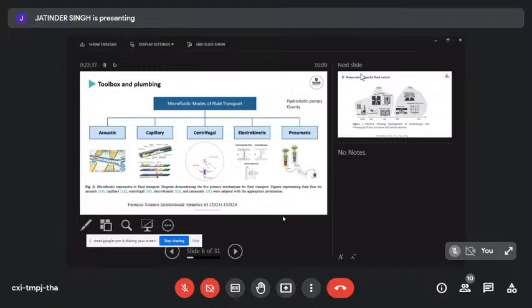If you just want, for example, when you're doing cell culture, to have a gentle flow over your cells to perfuse them with fresh medium and to remove any metabolites and other waste products that the cells produce, gravity-fed systems are really good, particularly if you want to have your cells sitting in an incubator, because no one is happy if you want to put a pump into a big incubator that looks like an oven.